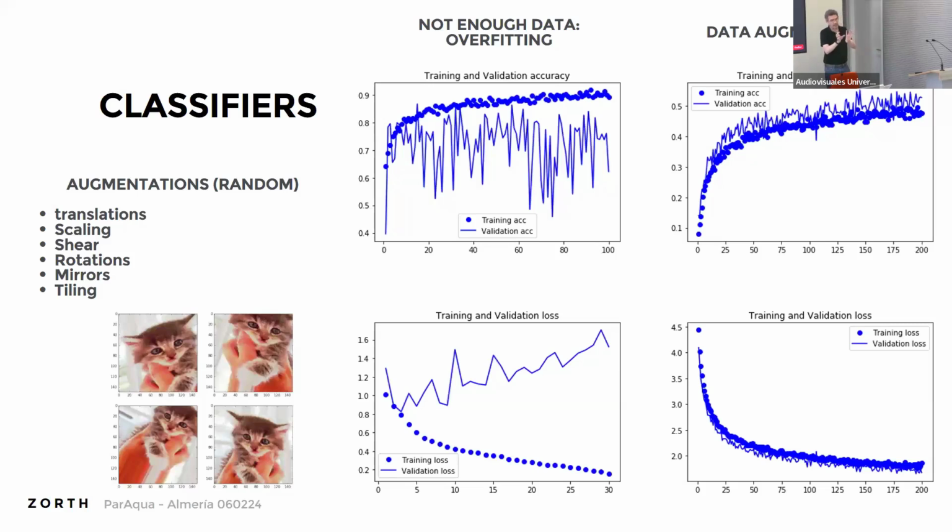So you're going to say, hey, I can move that image by 10% to the right, left, top, bottom. And that gives me a new image. I can do scaling. Scaling is dangerous for biologists, depending on what you're doing, really.